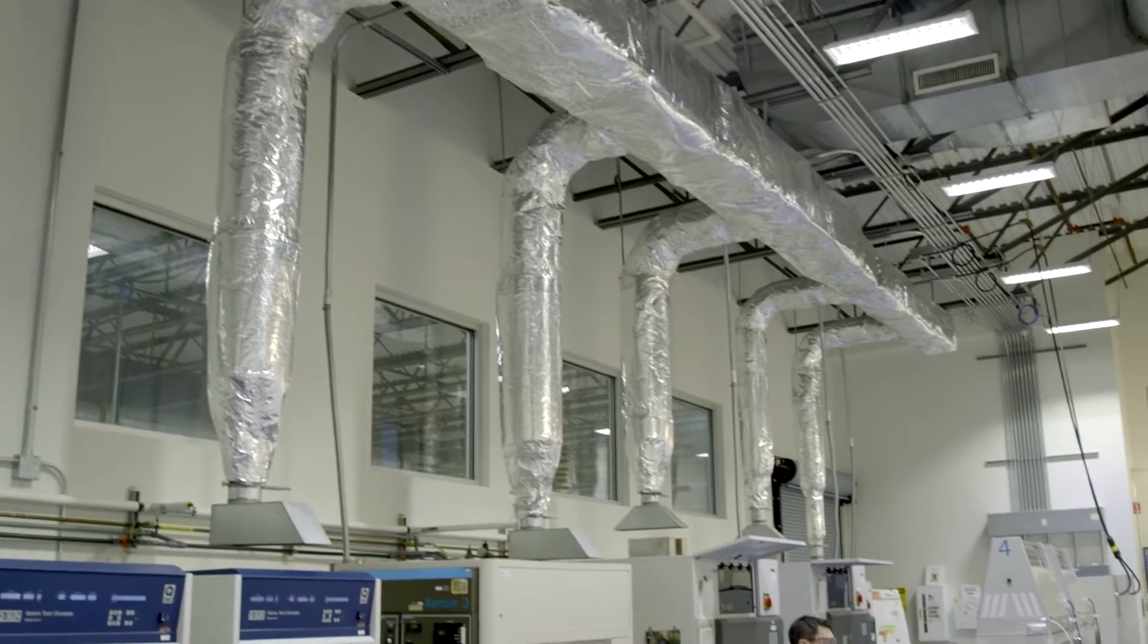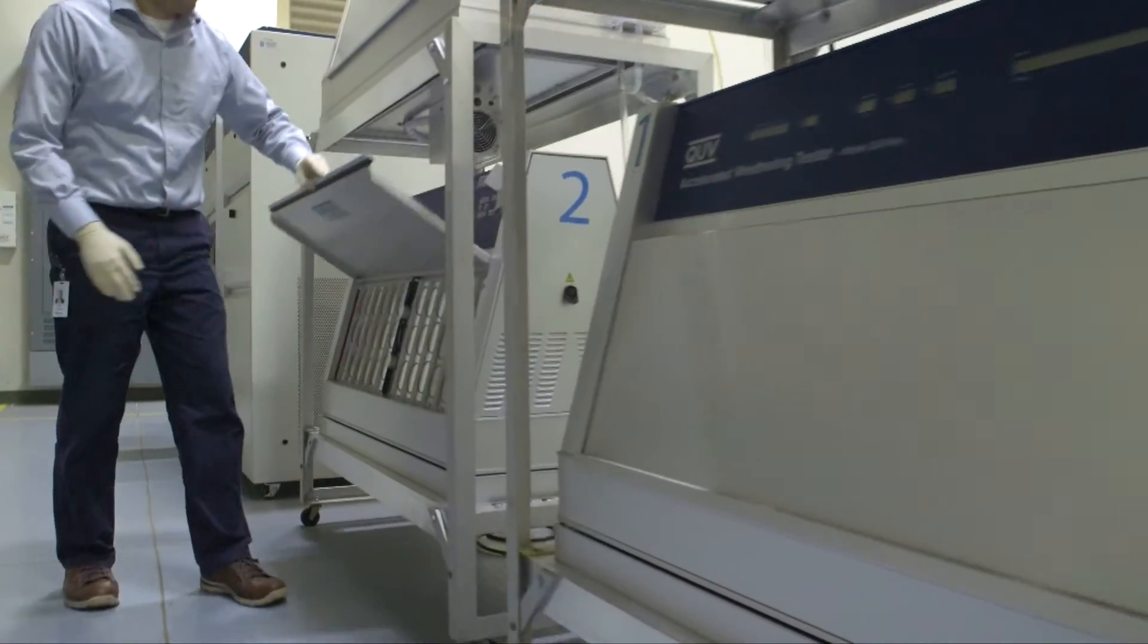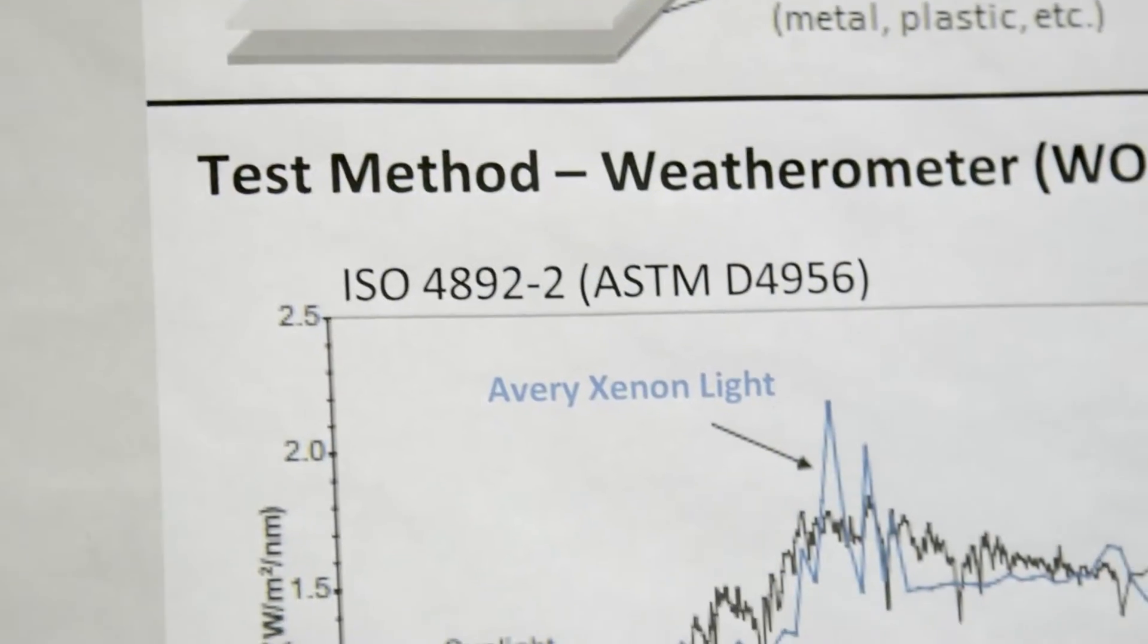at Avery Dennison is made up of various types of test chambers that include elements seen outside in real life, such as sunshine, moisture, and temperature.